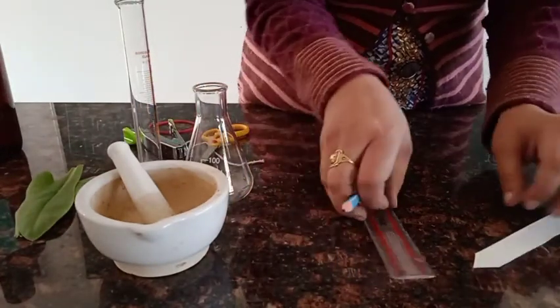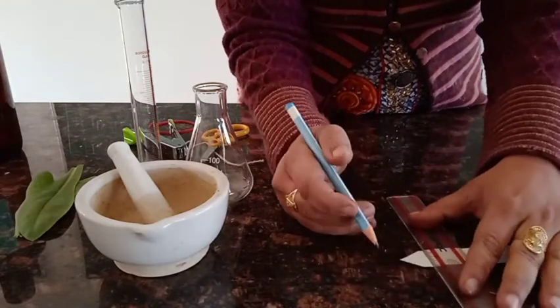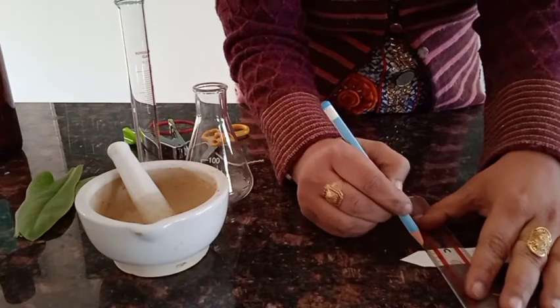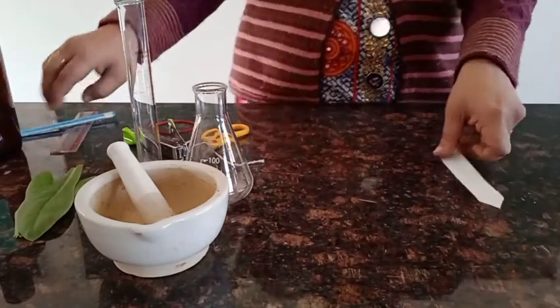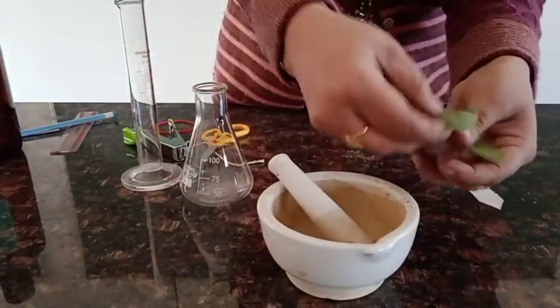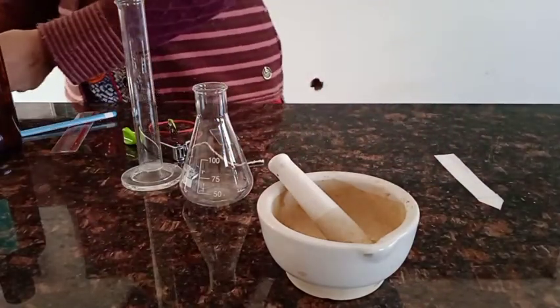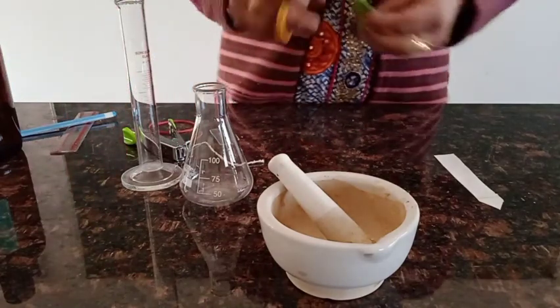We'll take the chromatographic paper and cut it into a strip. From the pointed end of the strip, about two to three centimeters up, we'll draw a line and set it aside. Then we'll take the freshly plucked leaf and grind it into a paste with the help of a pestle and mortar.